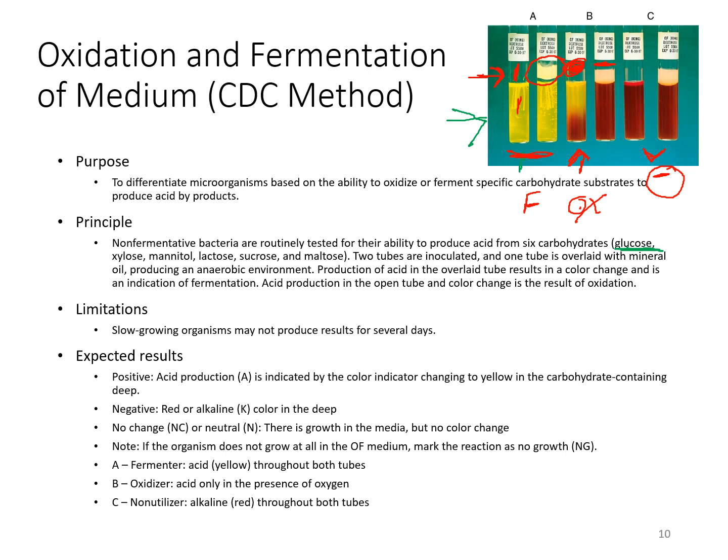And a lot of the modern methods today either use analyzers or they will use a long strip test where the sugars are all actually within little wells within that strip, and you'll load the organism into each individual one. So if, for example, you're looking for glucose in one, lactose in one, then you're looking for the color change in each of those.